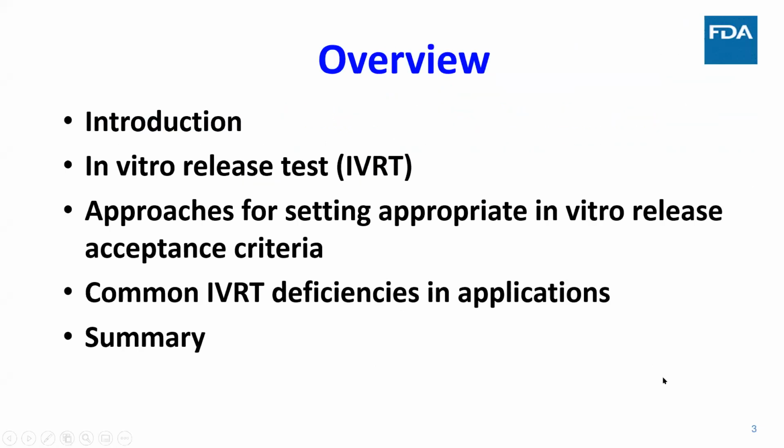So in today's talk, I will cover a brief introduction on vaginal rings, considerations on developing an in vitro release test, and approaches for setting appropriate in vitro release acceptance criteria for these rings, common IVRT deficiencies in applications, and a summary of my presentation.